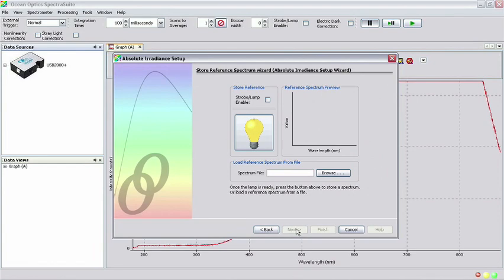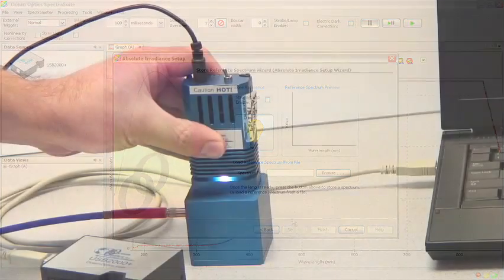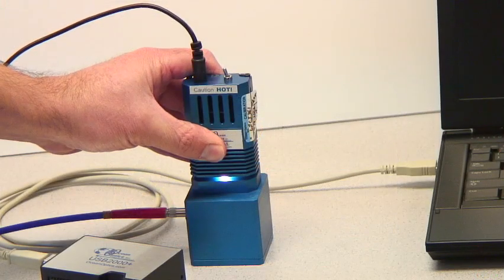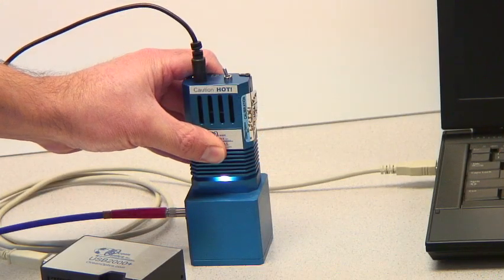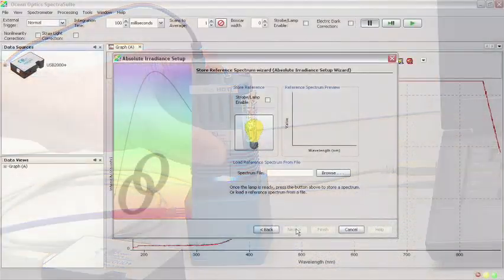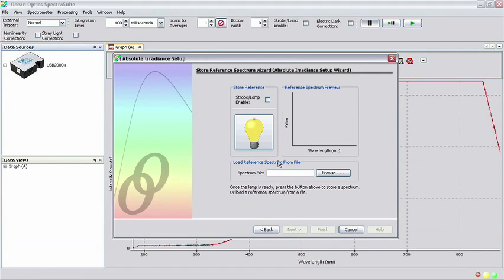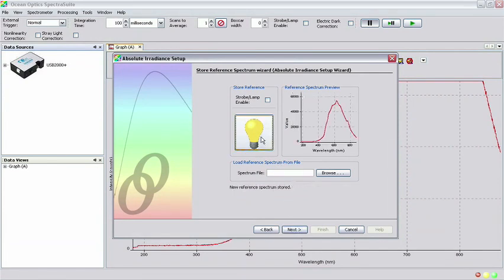Again, make sure that the light source is properly inserted in the integrating sphere. Click the yellow light bulb button to store the reference spectrum and click Next.